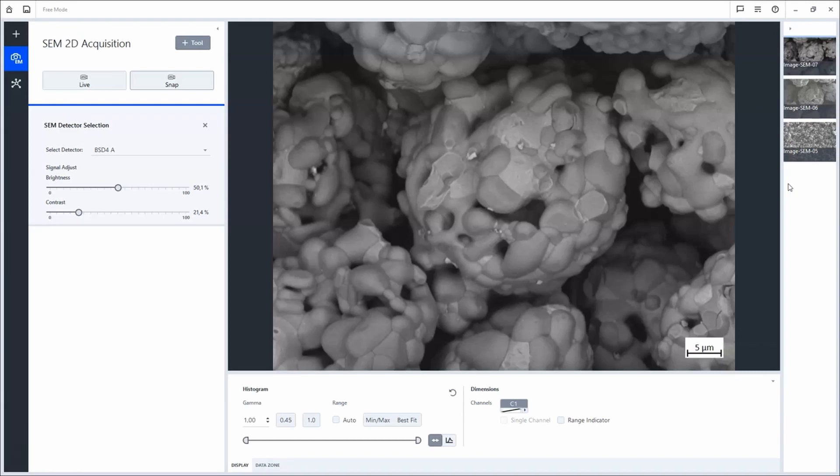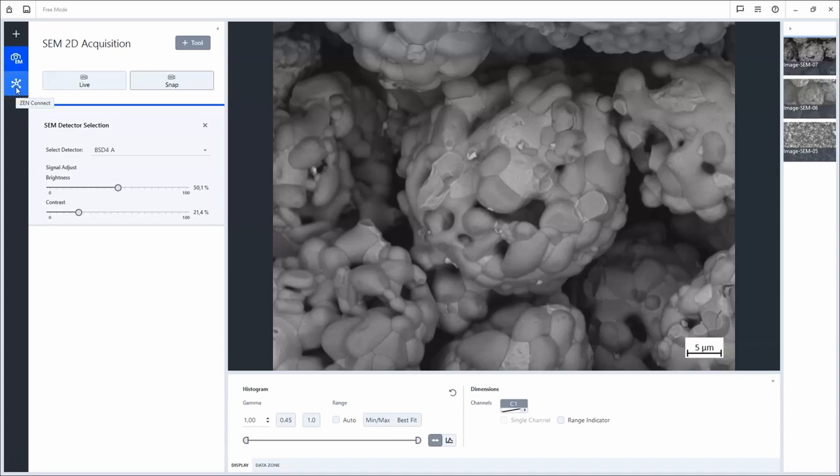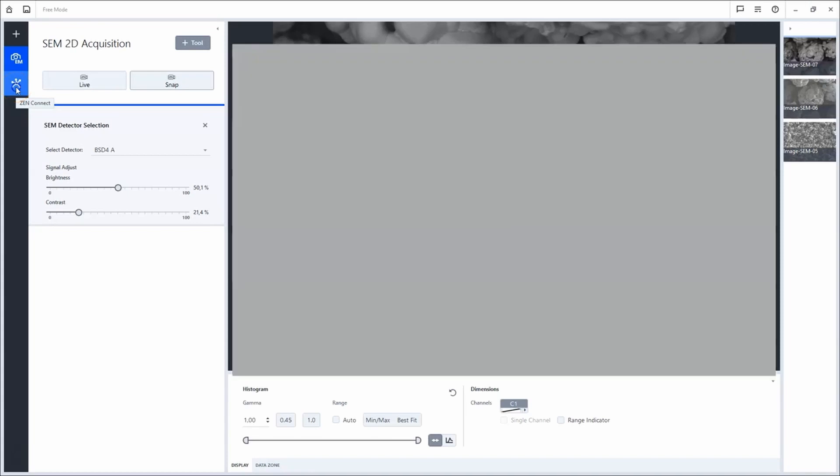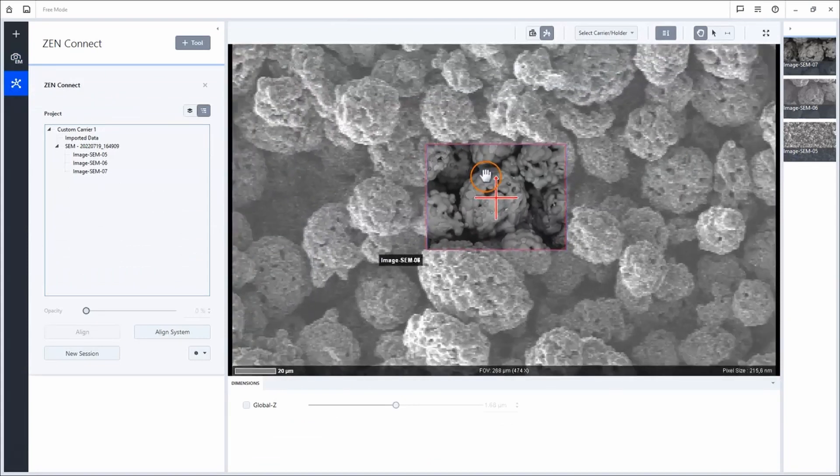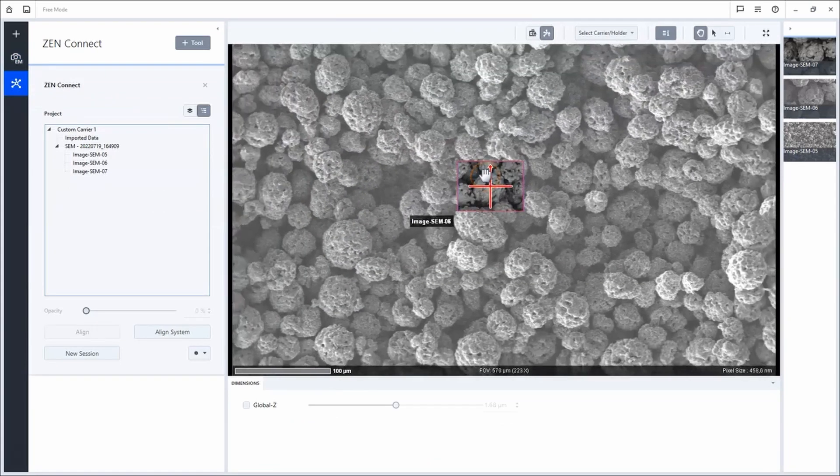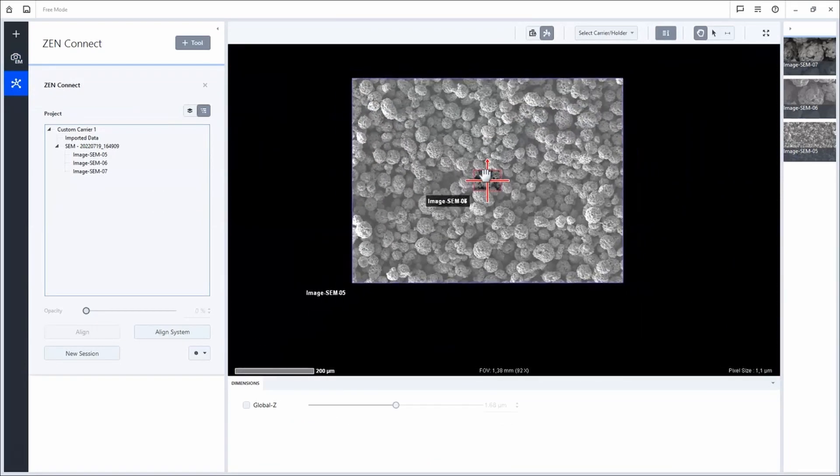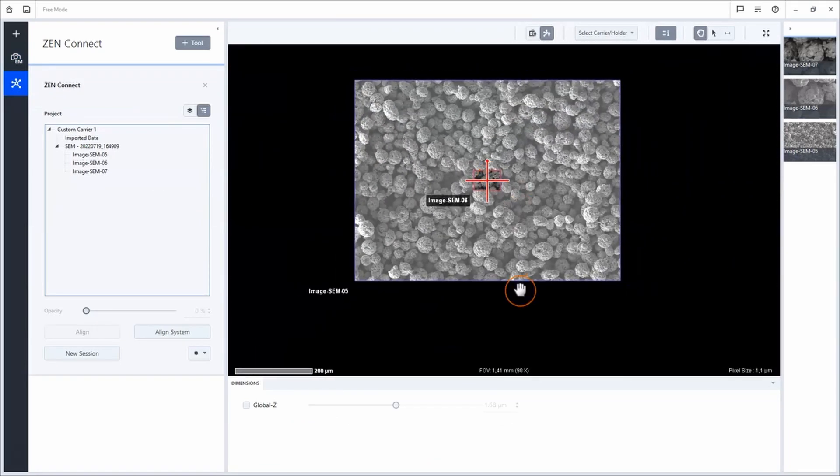In total, we acquired three images now. To see them in context, the only thing we need to do is move back into the ZenConnect workspace. Thank you for your attention.